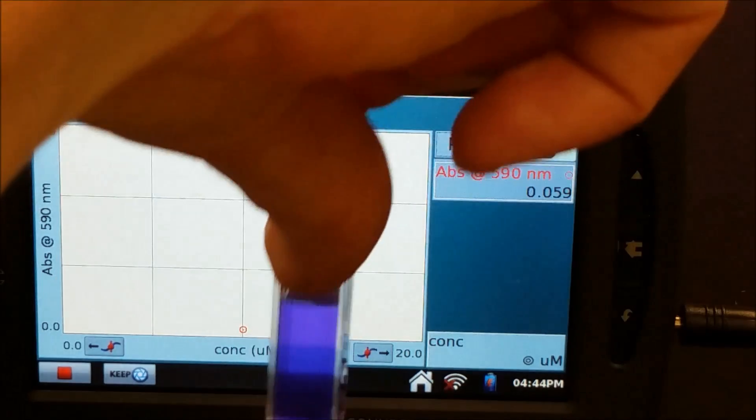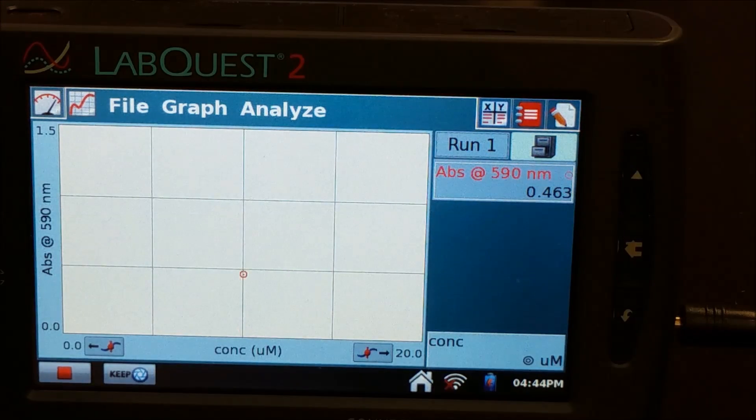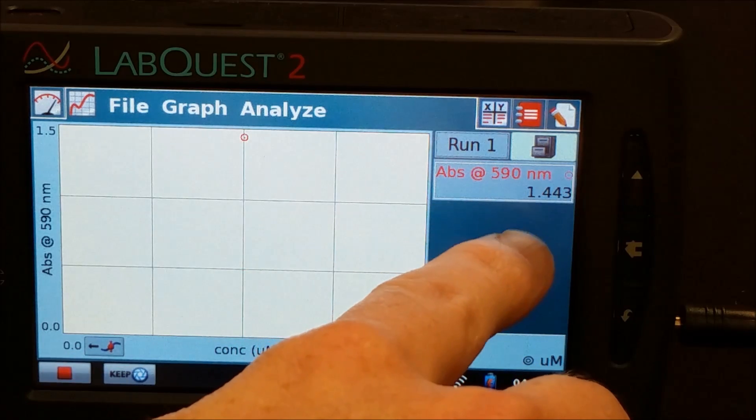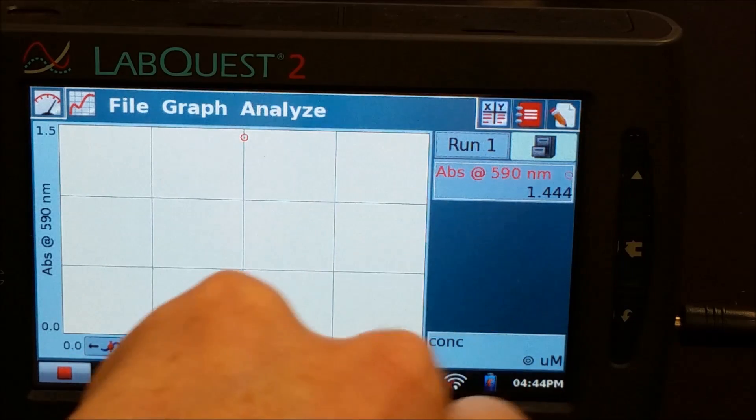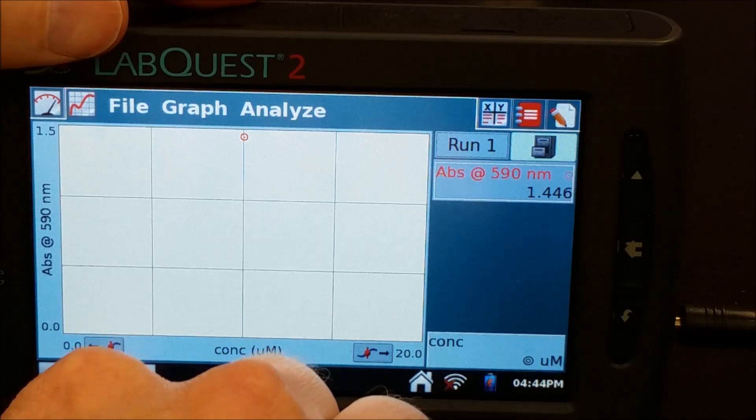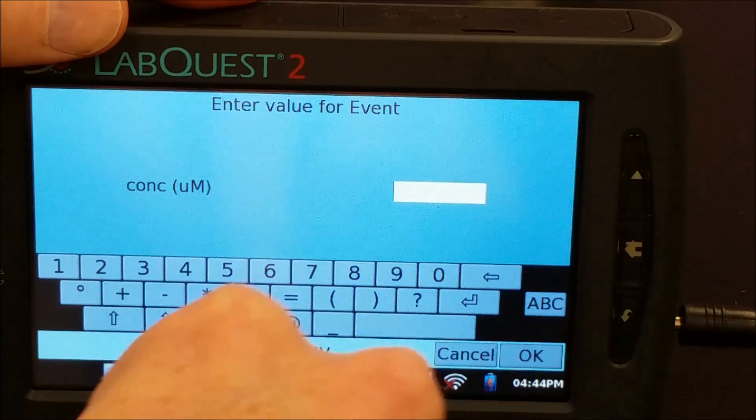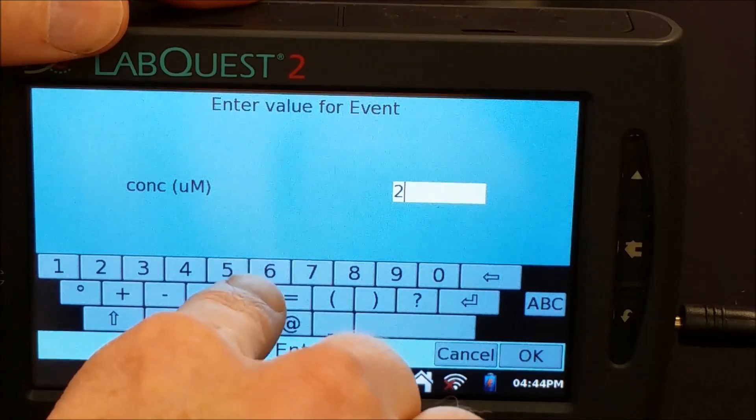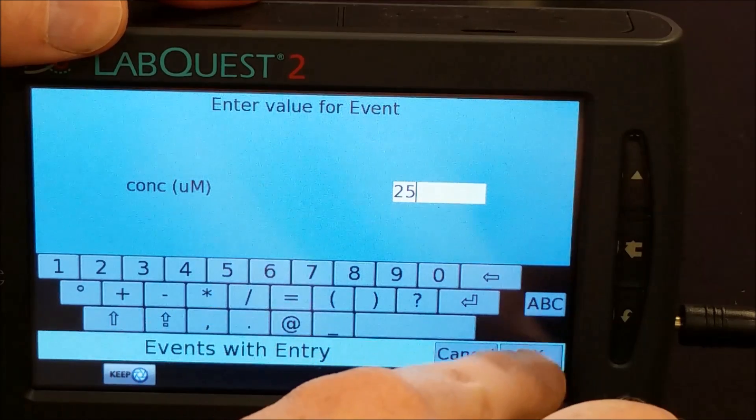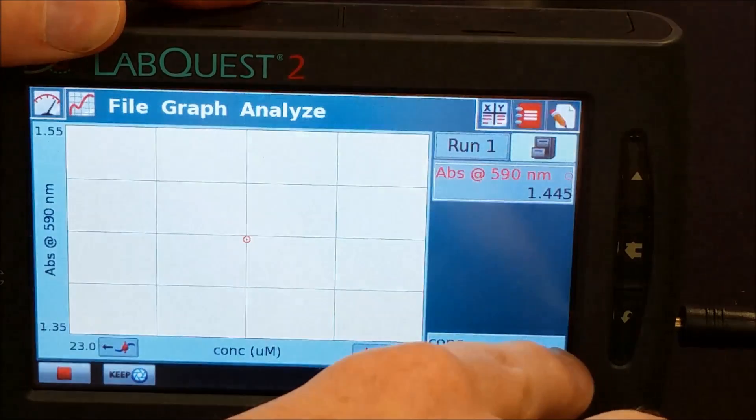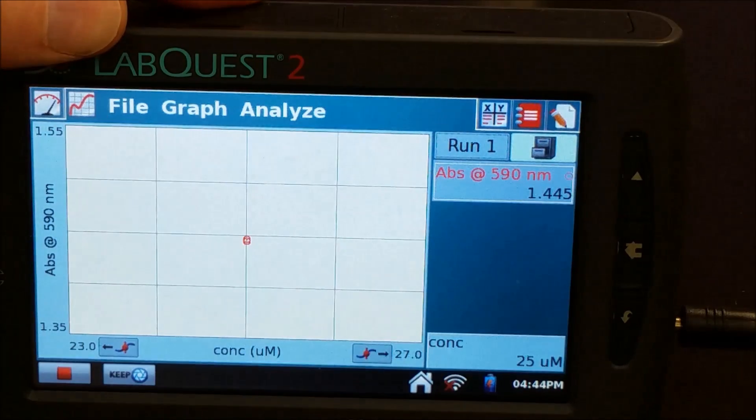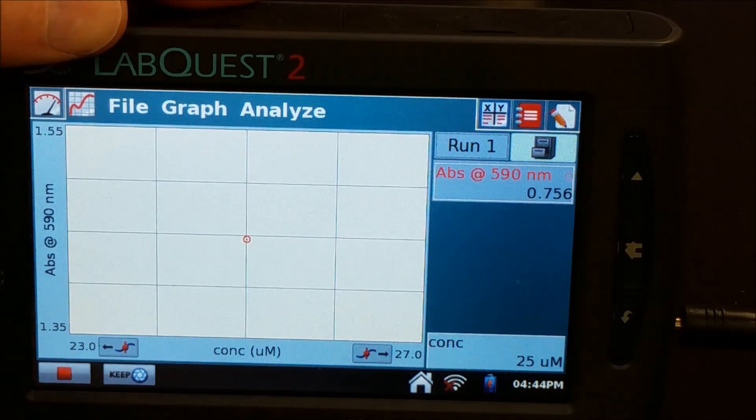And I'm going to put in my first sample of the 25 micromolar into the spectrophotometer. And when I do that, the absorbance goes up. And when it steadies, I want to hit keep and type in 25 micromolar. So now that that's steady, I'm going to take that out. I'm going to put in the next one, the 20 micromolar.